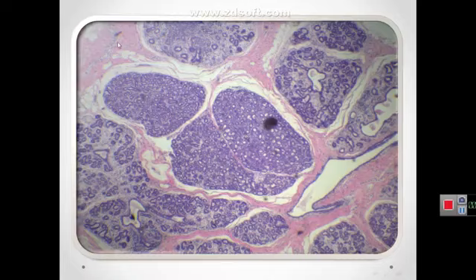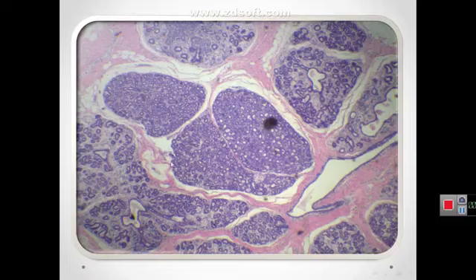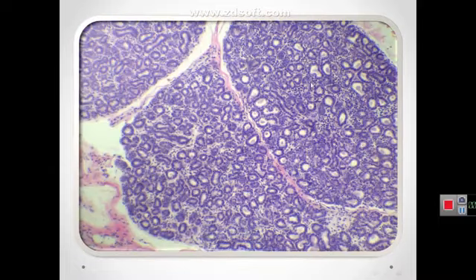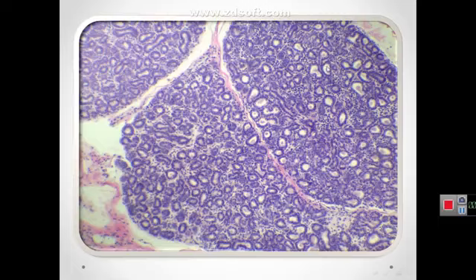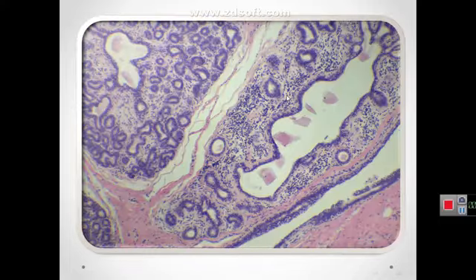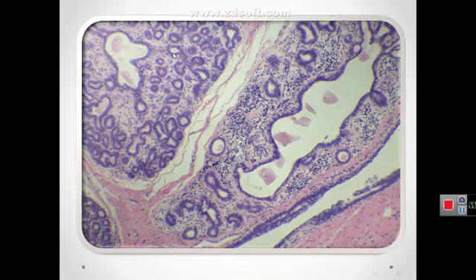During pregnancy, the stroma becomes less prominent. Each lobule consists of alveoli and intralobular ducts lined by simple cuboidal epithelium. The lumen is filled with colostrum, an acidophilic secretion.